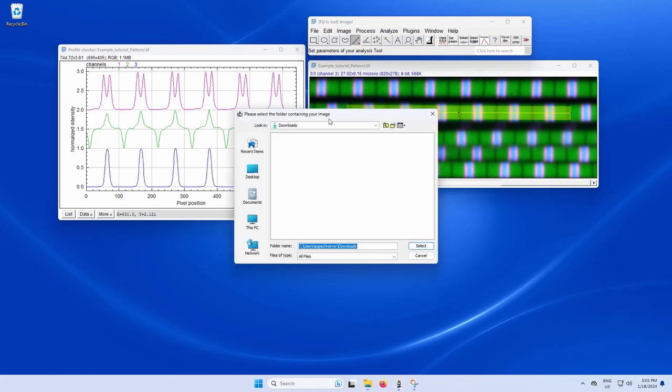When I clicked on the parameter button, a window opened to ask for a folder. This happens for most actions in PatternJ because we want to make sure that the right parameters are used and that the results are saved in the right folder. Unfortunately, there is no other way to do it, but unless you have opened another file in another folder while you are using PatternJ, this usually will only require you to press Enter.